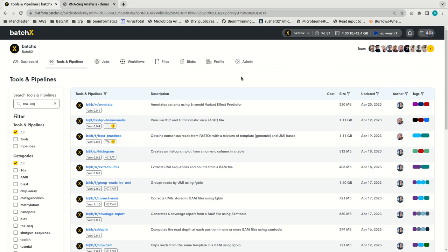And in this video, I will show you how to run an RNA-seq differential expression pipeline in the platform, as well as take a look at the outputs that this pipeline creates. I'm currently already logged into the platform, and we are in the tools and pipelines screen.